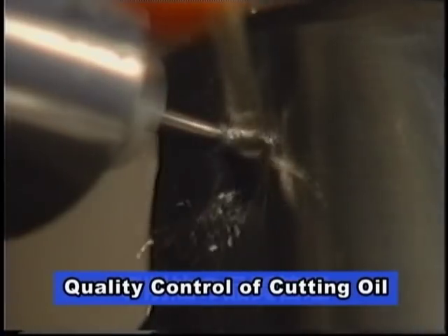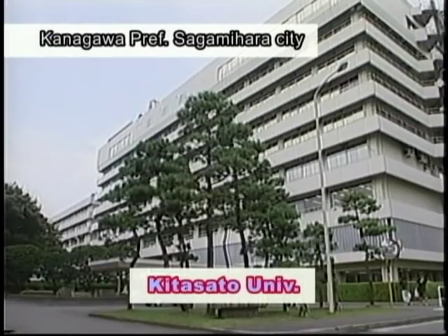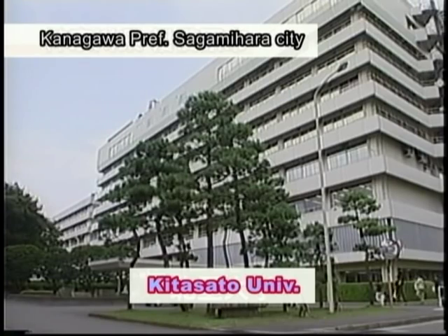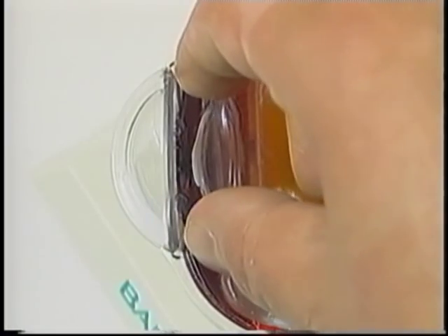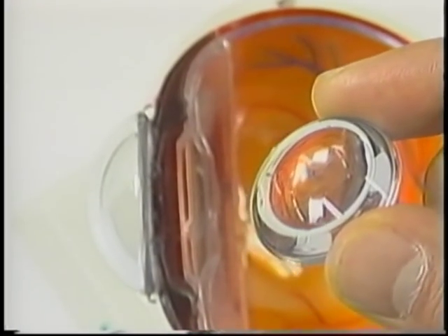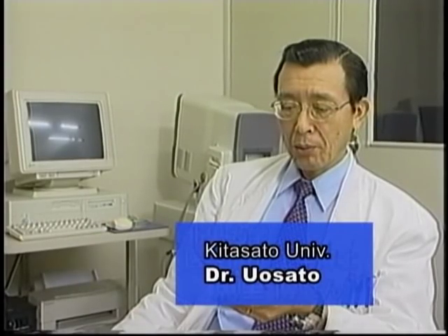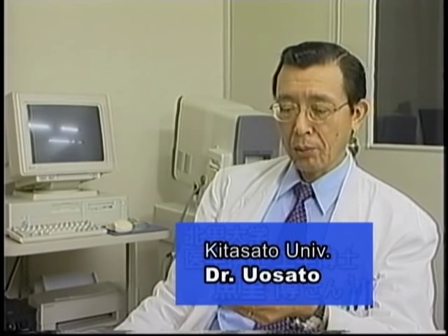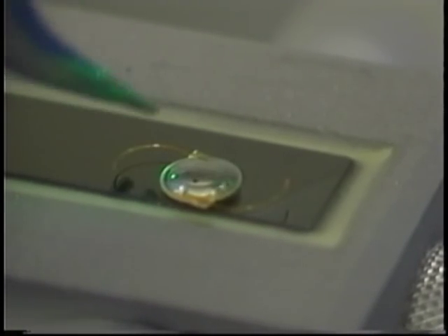For example, refractometers are used for quality control of industrial oil, blood serum, and medicines. In addition, recently at Kitasato University, Atago's refractometer is used for measuring the refractive index of artificial lenses, which act as real lenses for eyes. When performing cataract surgery, artificial plastic lenses are implanted. We have to calculate and then decide the strength of the lenses before the operation.